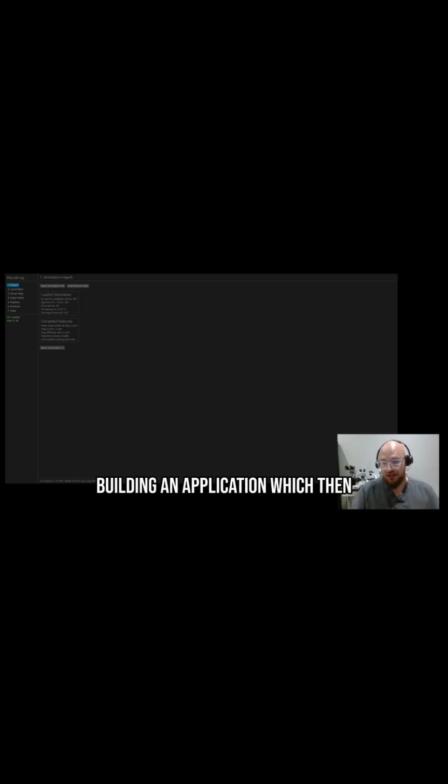So I started building an application which mimics what is required for the configuration of that system, in hopes that as I'm refining the functionality of the Gumol MicroDrop, I can then provide a client so I can export the files. That's just how I'm understanding it from what's available online.